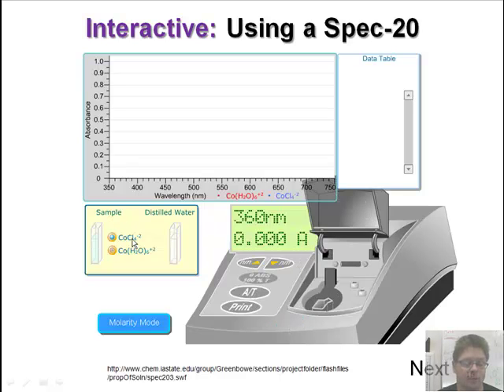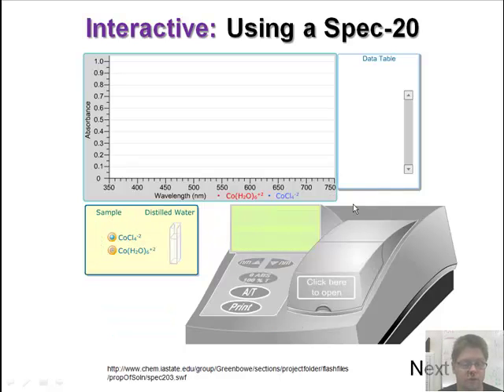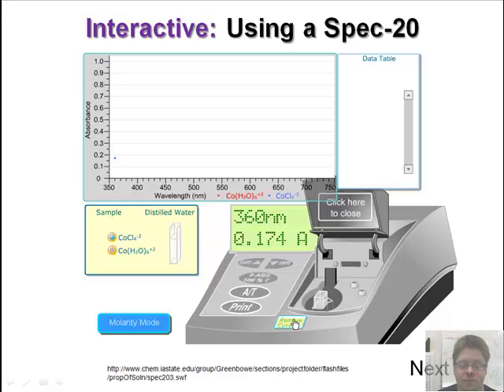Now we remove our cuvette. Now we can take a sample. Here's cobalt. And you can see the absorptivity of 0.174, transmittance 66.99. So here we've got absorptivity, absorbance versus wavelength. We press print. We got a point. Open this up. Remove the cuvette.